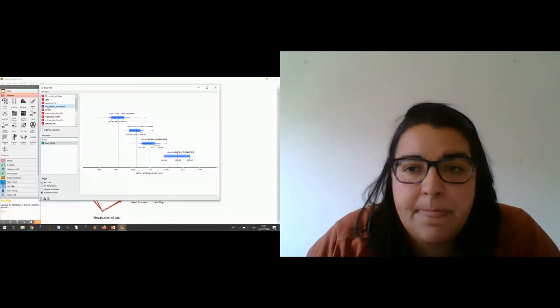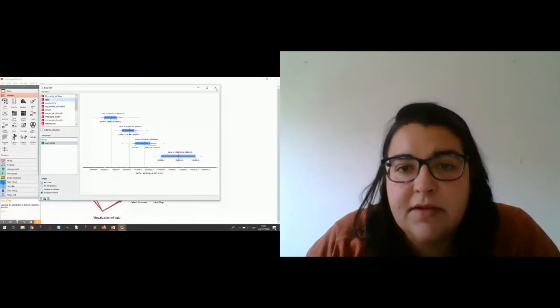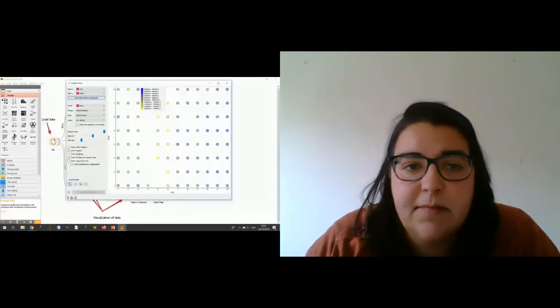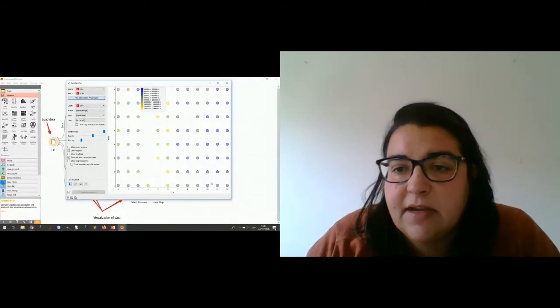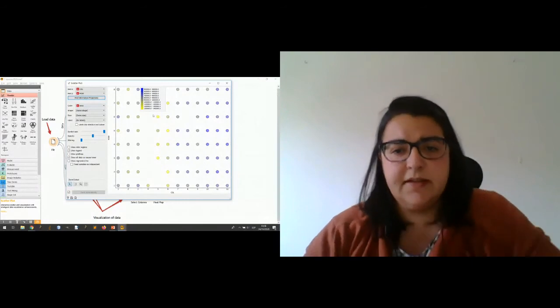Okay. Another way to see the data is using a scatter plot, and I think this is very useful because you see the plate. You can see the plate if you put the column and the row on the axes. And later, if you use color with any feature, you can see with a heat map what this feature means in this place. For example, the wells on this side of the plate are smaller than this one, and I think that is very useful.